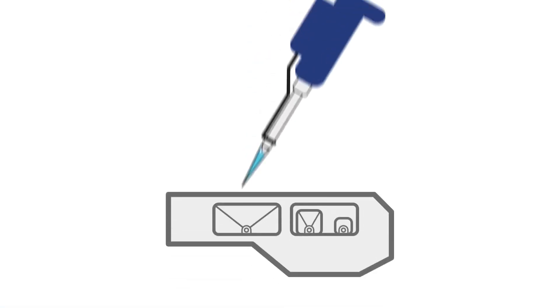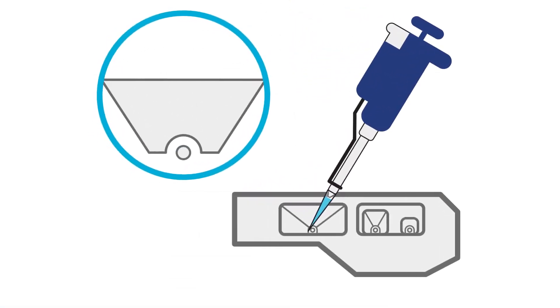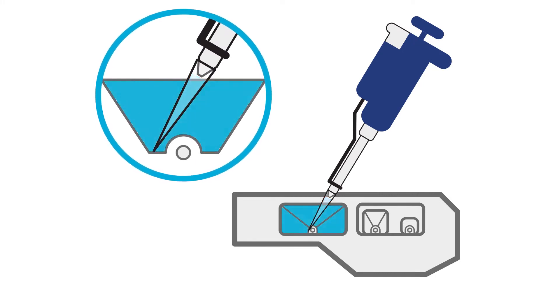To achieve the best results using Spark and to avoid premature flow into the microfluidic channels, it is important to use the correct technique when pipetting fluids into the Spark cartridge.